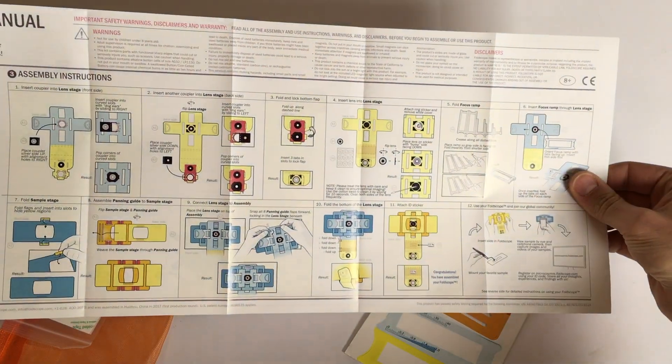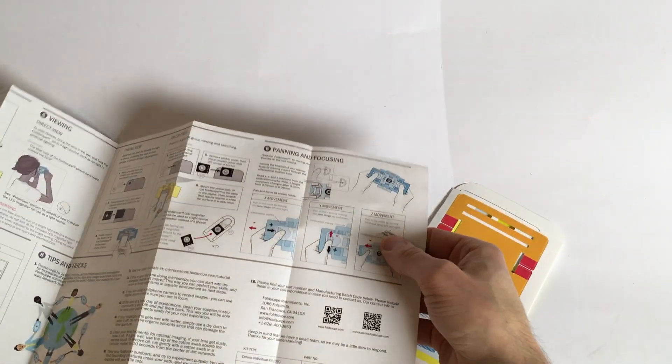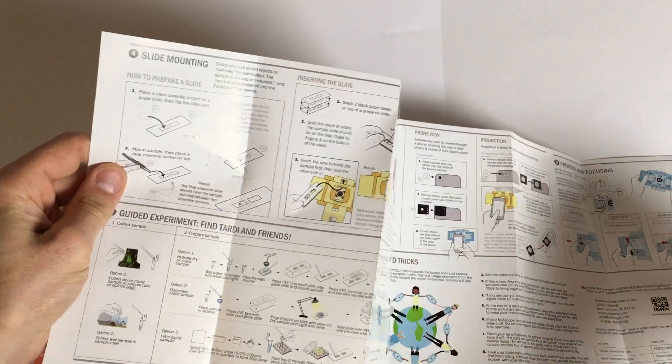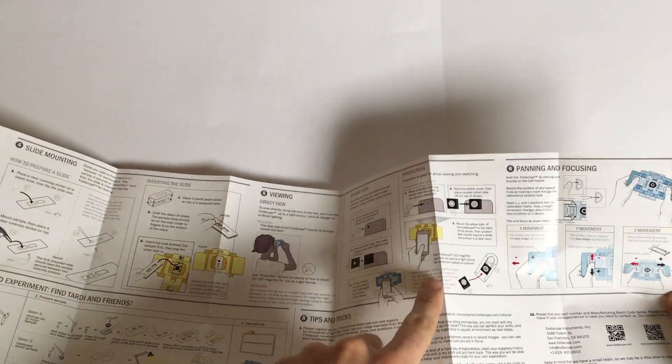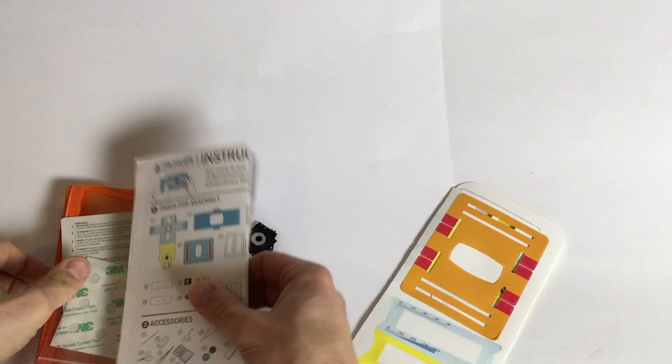We got the instructions — huge instructions — and this is what we are doing today: we are going to assemble it, not disassemble it. Here is some information about how to probe it, how to prepare your slices, how to attach your smartphone to it, and how to use it. But that's quite self-explanatory; we just start with the easy part.